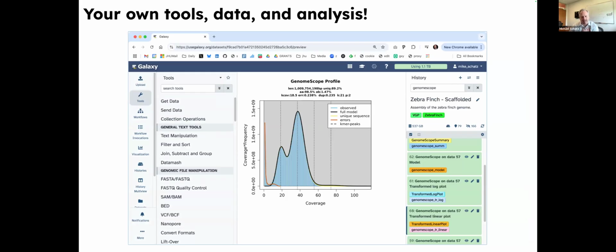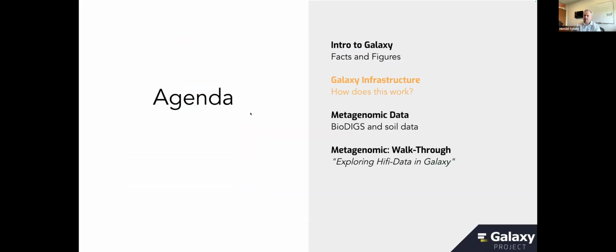If I want to, I can choose to share this with other people, but by default, it's all just for me. It's very private data for me. So you don't have to worry about people stealing it or looking at it. It's up to you to control. If you want to share it with other people, of course, we encourage you to do so. But it's all very private to you as you're getting started. And again, it takes 2 seconds to be able to do this, and is a great way to do analysis.